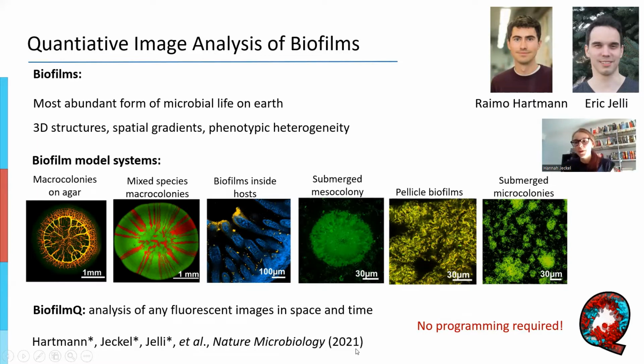However, BiofilmQ has been available since, I think, summer of 2019, and has been used ever since. It's a software that has a graphical user interface, so there's actually no programming required to use it. This was very important to us because we wanted to have it accessible to as many people as possible, and we didn't want to have that barrier of people having to learn how to program before they will be able to use it. BiofilmQ is freely available.